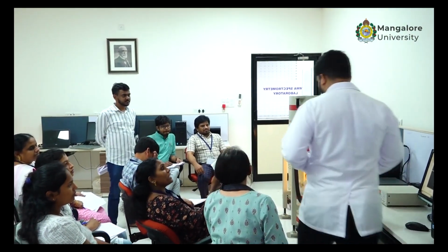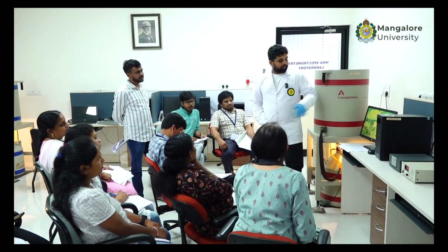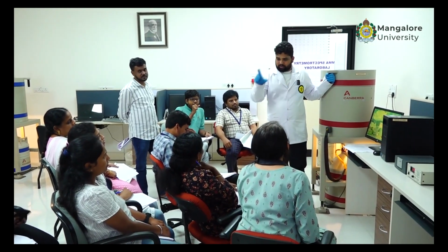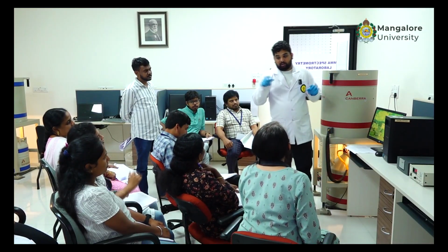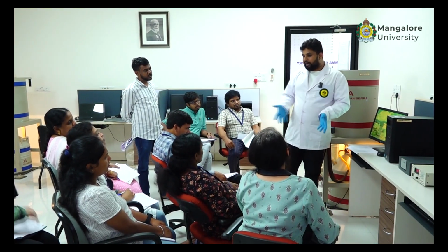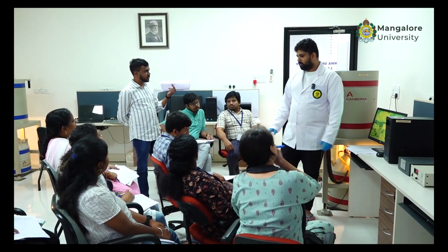One more question. When we are taking the background, do you keep that thing on? No. See, there are 2 types of backgrounds you can take. We keep the empty detector, we don't keep anything. We don't keep the bottle. Otherwise, you can also keep the bottle to subtract the background coming from your container. That also is acceptable. These bottles are glass bottles?